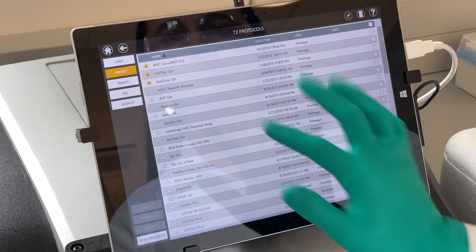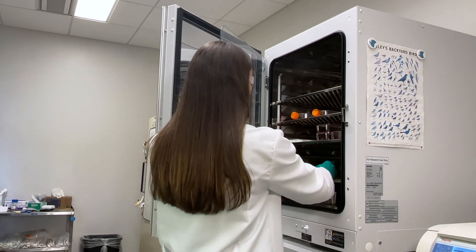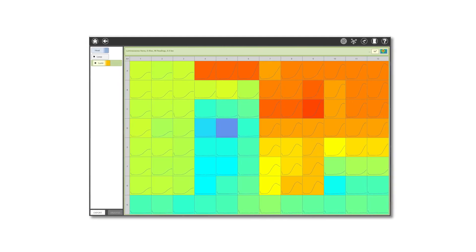Now that it's set up, let's take a reading. The reads are fast, and once it's complete, I place the plate back into the incubator until the next time point. This simple manual process eliminates the need for an expensive plate reader to get great 3-day kinetic data. It's as easy as that.